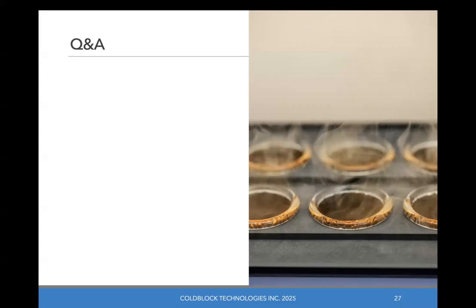Thanks, Heather. That's a great first question and one we've received numerous times. We've had a number of calls with the team at the EPA to discuss this. And to be clear, the EPA does not approve specific equipment. They've stated very clearly to us that alternative technologies can be used if you can demonstrate equivalency or better performance. What matters is proving that the method you're using can produce the same or better results. So again, the EPA doesn't mandate specific equipment. It's up to you to validate that method and show that it's fit for purpose.